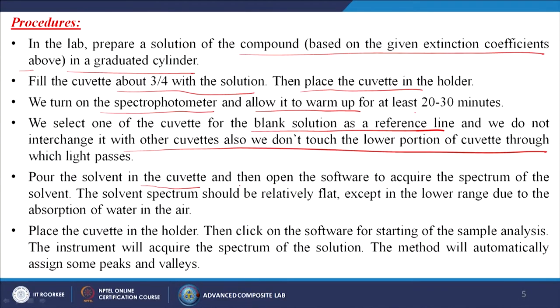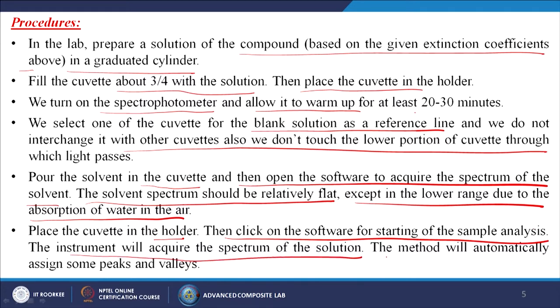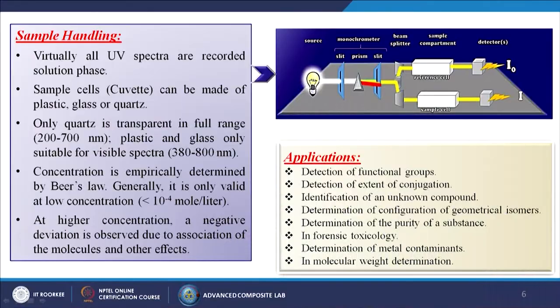Do not touch the lower portion of cuvettes through which the light passes, otherwise fingerprints or contamination may occur. Pour the solvent in the cuvette and then open the software to acquire the spectrum on the solvent. The solvent spectrum should be relatively flat except in the lower range due to the absorption of water in the air. Place the cuvette in the holder then click on the software for starting the sample analysis. The instrument will acquire the spectrum of the solution; the method will automatically assign some peaks and valleys. This is the whole procedure for how we perform UVVis analysis for our sample.